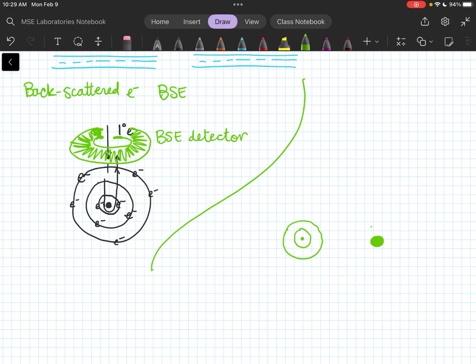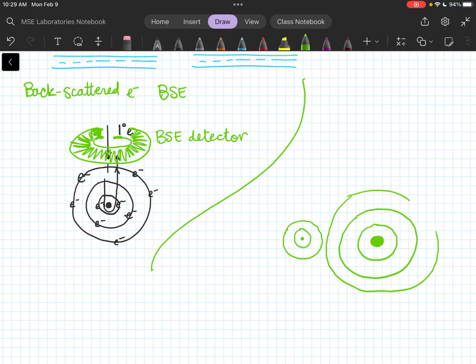That is a larger atom with a larger nucleus. Which do you think is going to be more sturdy for this slingshotting action? The second one, that big heavy one. So with this littler one, we're going to slingshot some back, but not nearly as many as will slingshot from this larger nucleus.